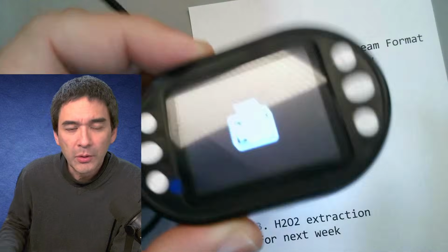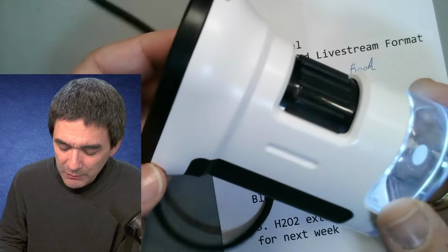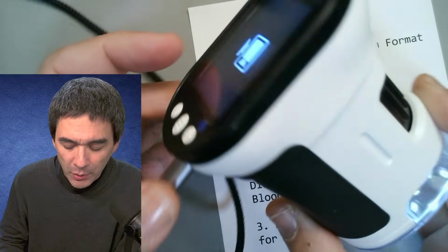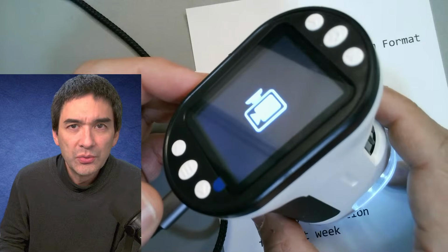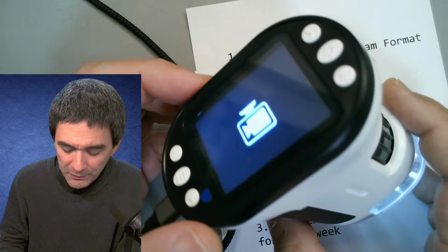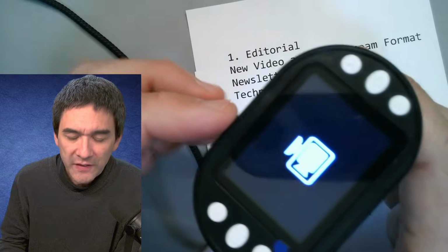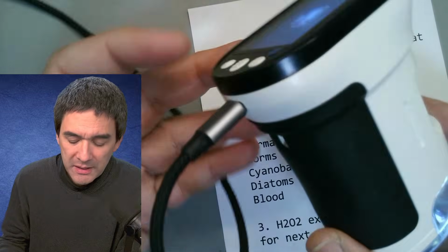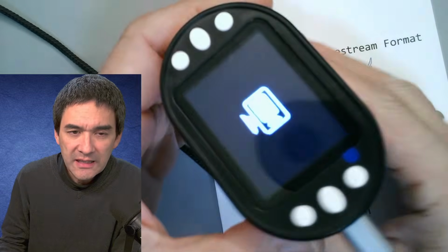Just very quickly, I'm going to run you through the features and some of the, I would say, design issues that I'm not totally happy about here. First of all, a little bit of a reason why I actually bought it: I want to have a field microscope where I can do some recording without having to take samples back home, right? So this microscope has an SD card over here, and it allows for direct observation and also recording into the SD card, and it also has over here a USB-C connector, and I can of course take pictures, and they can also be displayed here.